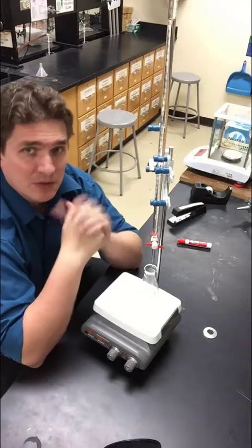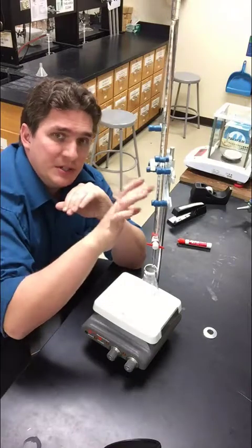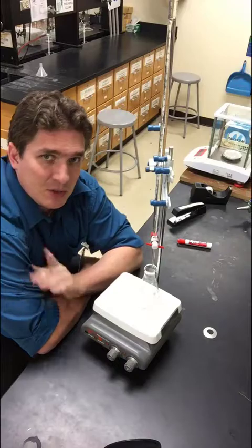So that's your big picture view of a titration. Two pieces of glassware, your burette, your reaction flask. We're using this to react this, and we have to know enough about one of these two to figure out the concentration or amount of the other one.